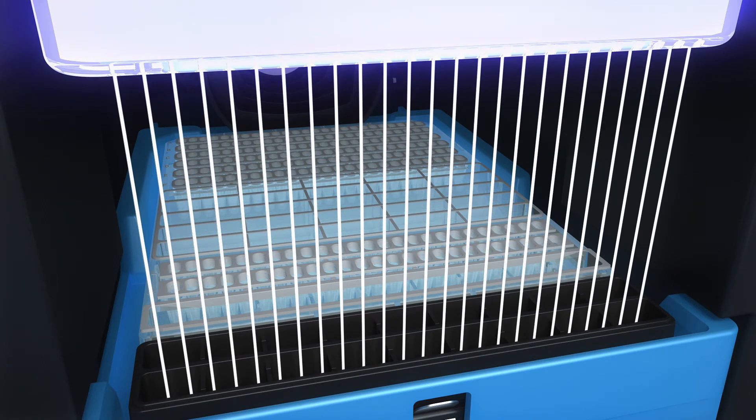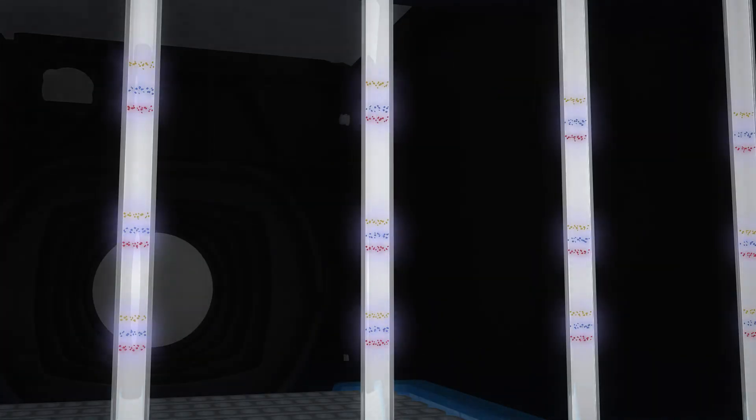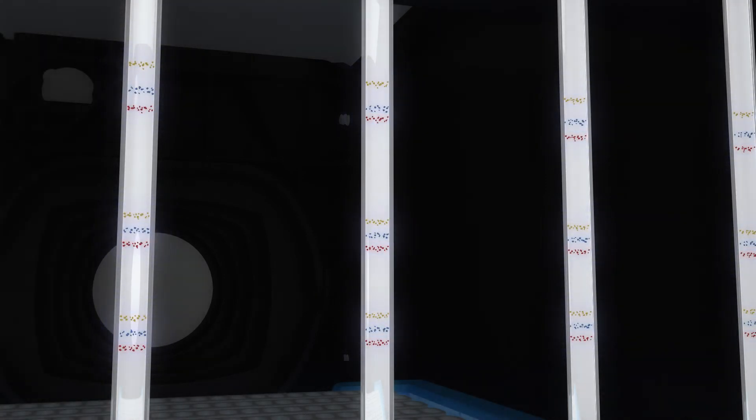Once the separation is complete, UV light immobilizes the proteins covalently to the capillary wall, and the matrix is cleared from the capillary.